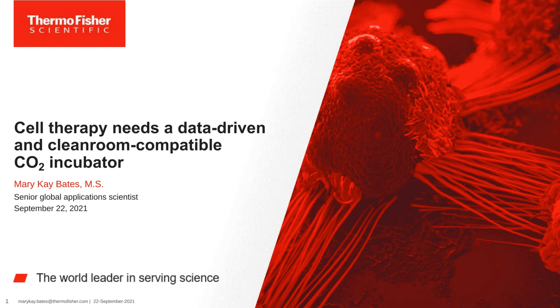Now, before I go too far, I want to say that I understand that not everyone is using a CO2 incubator for cell therapy production in a clean room, but maybe this information will help you as you start to think about that transition. Over the last year, our team here has spent a lot of time thinking about this, and a lot of this information is reflected from talking directly with our clients working in clean room settings who are scaling out production. So let's begin with my agenda.